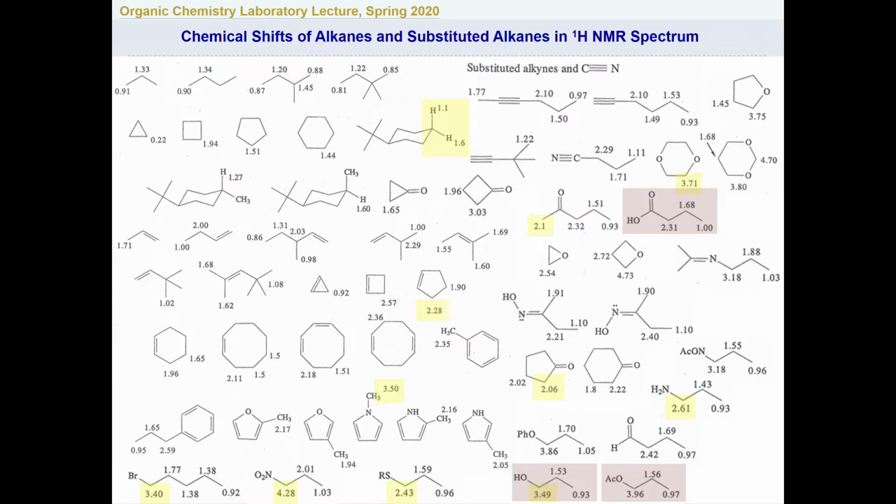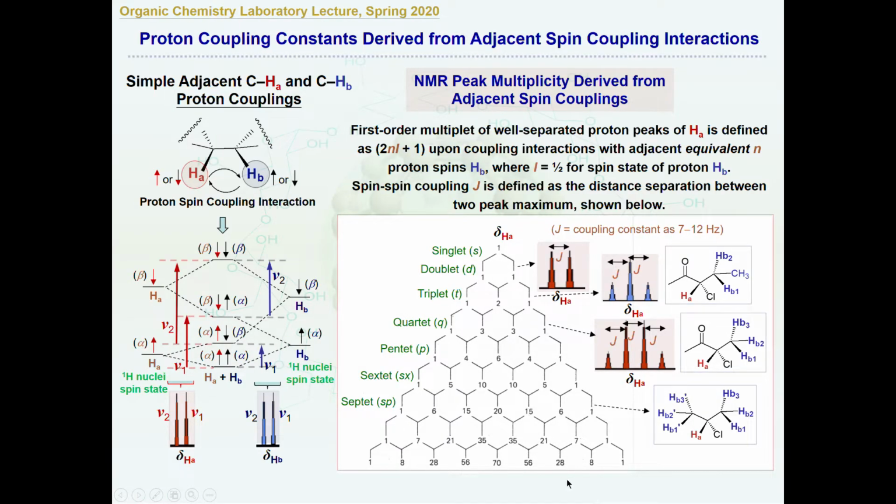And here I give you one view graph that indicates the different, precise numbers on example molecules, and you can see the chemical shift for each type of proton is different. That's the reason the NMR is so powerful and so precise that you can pinpoint what type of proton you have and the location of the proton, next to the carbonyl group or next to an aliphatic or aromatic proton, all with different chemical shifts. That will allow us to verify different structures.